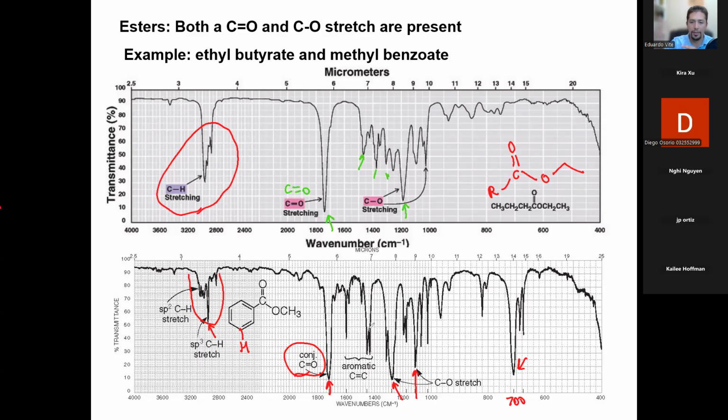You don't just randomly pick a peak and say, I hope this one is the carbonyl. No, you should have some idea. But yeah, adding an aromatic conjugated system makes things a little interesting. But in general, the signals are still pretty characteristic and they are still present.